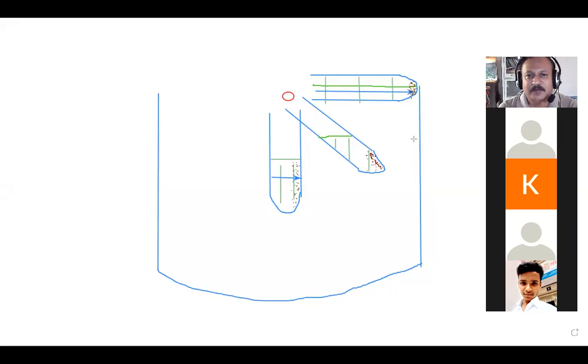Sir, maybe it will produce too much centrifugal force, which will affect the rotors. I think centrifugal force should be more. Maybe it can damage the mechanical system of the rotor. Why will it damage? Maybe it can just open off or fall off due to too much force. What will fall? Sir, the spinning elements or the rotor, sir.